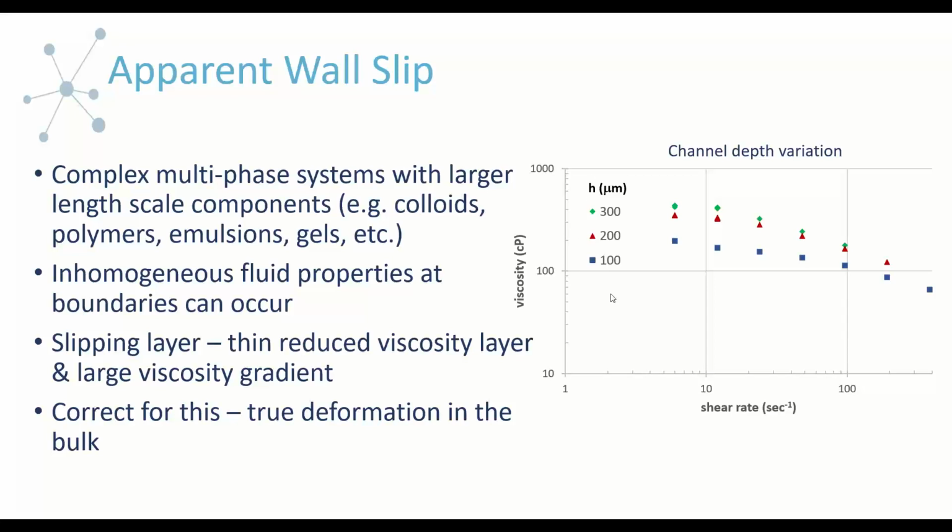I'll point out that if you are doing this with capillaries with circular cross sections, you have to be concerned about entry or exit effects. We don't talk about this a lot, and I don't want to confuse the situation, but we don't have to worry about entry or exit effects in our particular flow system, because our sensors are placed in the channel and the leading and trailing sensor are spaced at an acceptable distance from the entry and the exit. So we don't have to do any corrections for entry or exit effects, the Bagley correction.